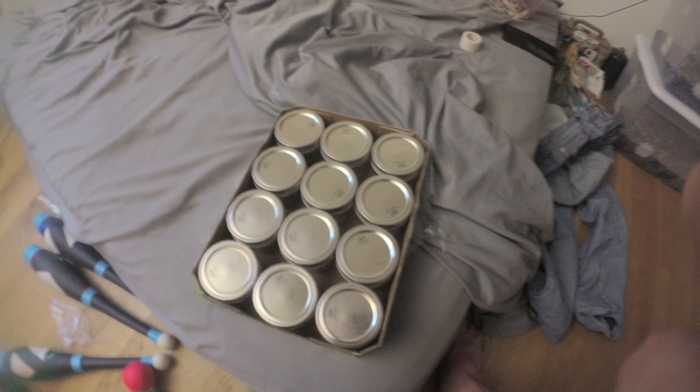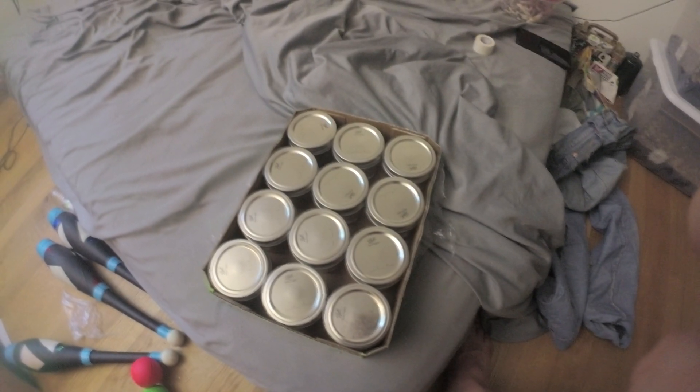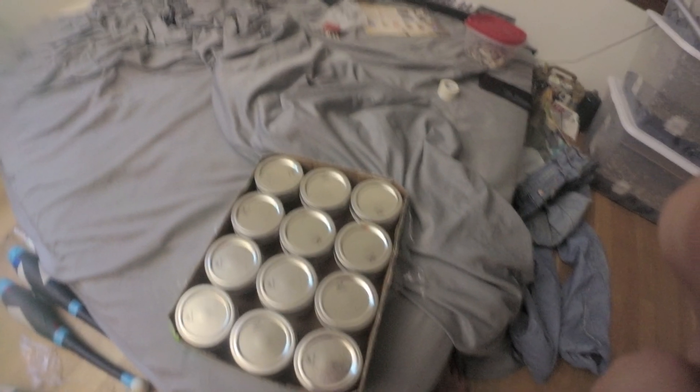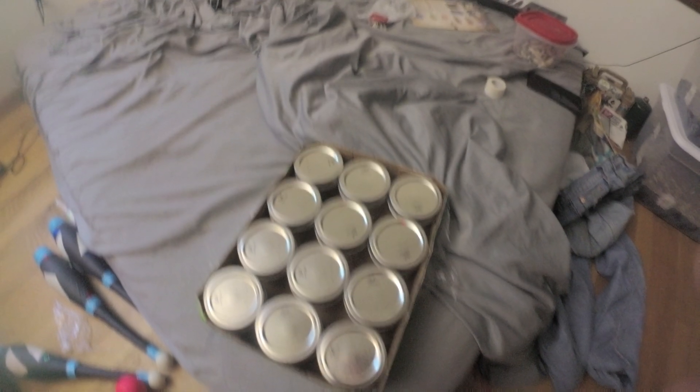What's up guys, MicahDogs here. Today we're going to go over how to make these agar jars instead of agar plates. A lot of people find it easier to use jars because it doesn't require pouring in a sterile environment — you can pressure cook the jars afterwards.